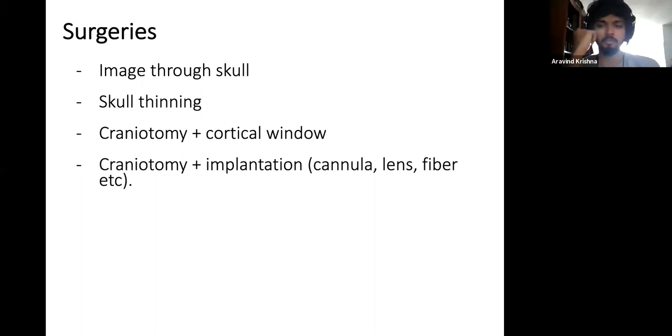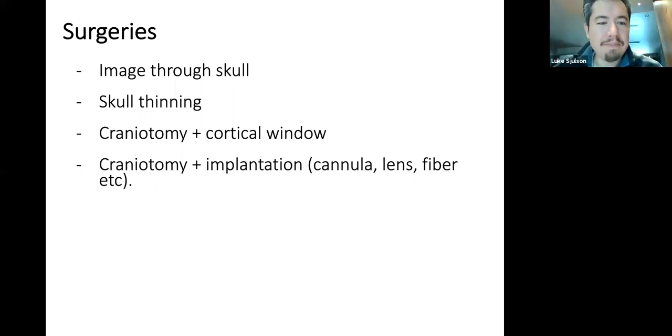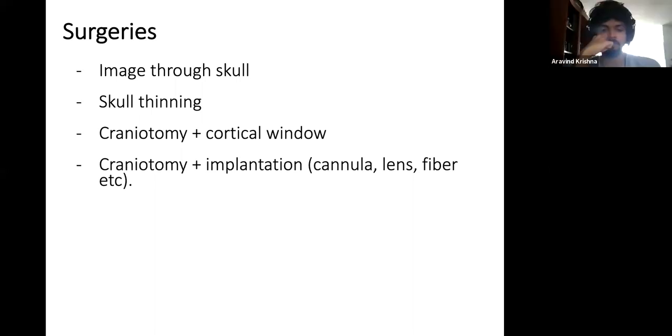Hey, Luke, I have a question if you don't mind. Yeah, sure. I was wondering, when you, for example, record at 10 hertz temporal resolution of, say, 10 cells using GCaMP, the latest GCaMP, and two-photon microscopy, I wonder if the signal that you get is equivalent to, for example, the summation of spiking activity or the field activity in that cell over the 10 hertz resolution.